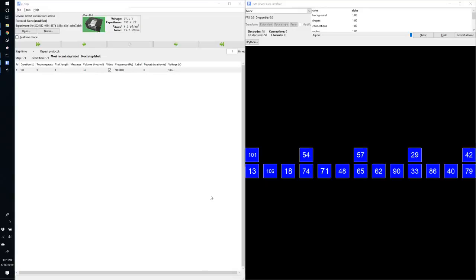In this video, I'm going to demonstrate how we can explicitly tell MicroDrop that two electrodes should be considered adjacent. In other words, that a drop can overlap, when it's in its relaxed state, from one electrode to the neighboring electrode.